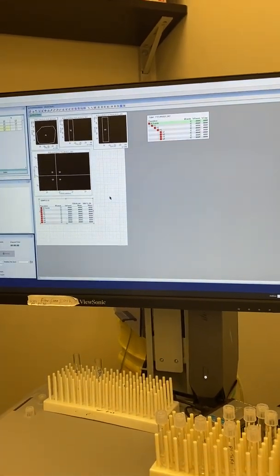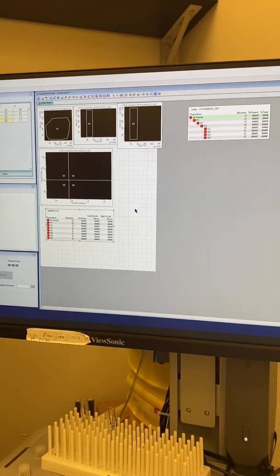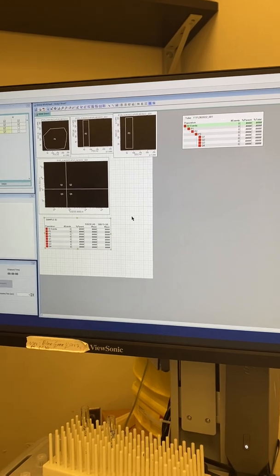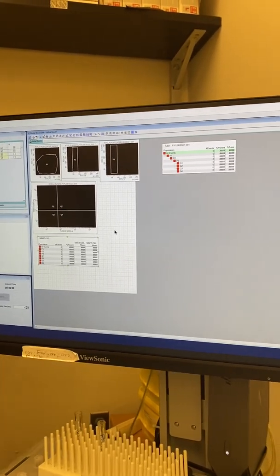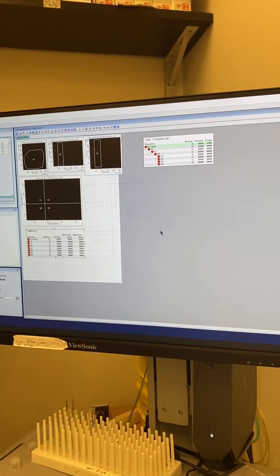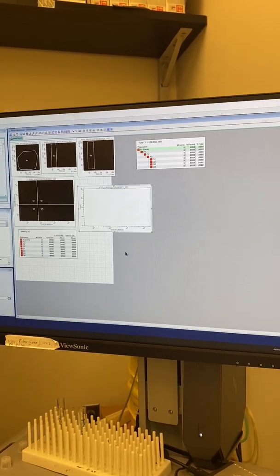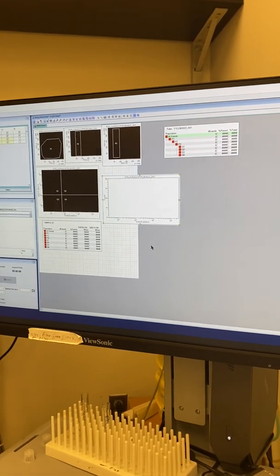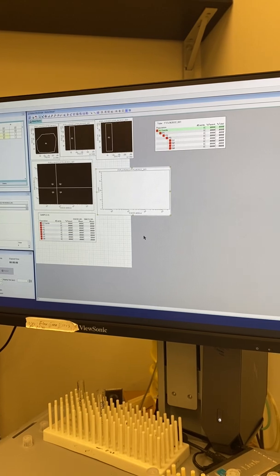So that is how you make a 2-parameter plot or 2-parameter protocol. There are many other ways that you can draw gates, and you can draw single plots, like a histogram plot right here. Choose a histogram, single plot, and choose the area parameter there, or different ways you can do it. It's all up to you and your PI and how you discuss to go forward and which way is the best.